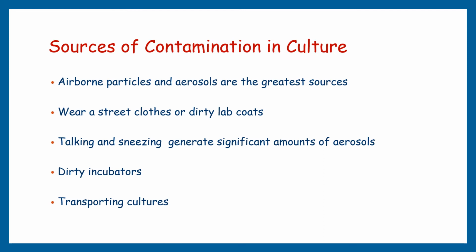Incubators, especially those maintained at high humidity levels, can be a significant source of biological contamination in the laboratory. Dirty water reservoirs and shelves or culture vessels soiled by spilled media allow the growth of spore-generating fungi.